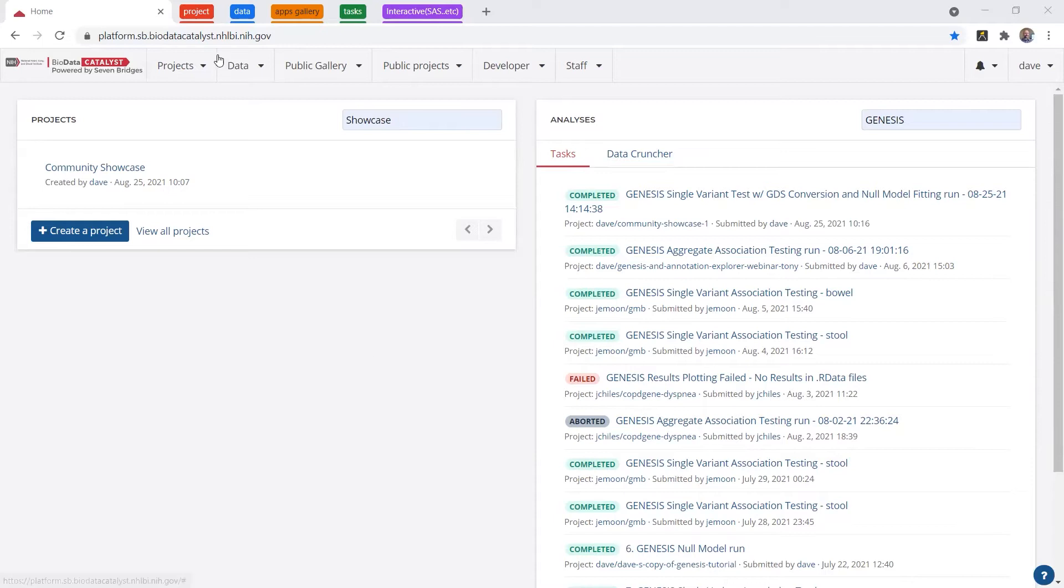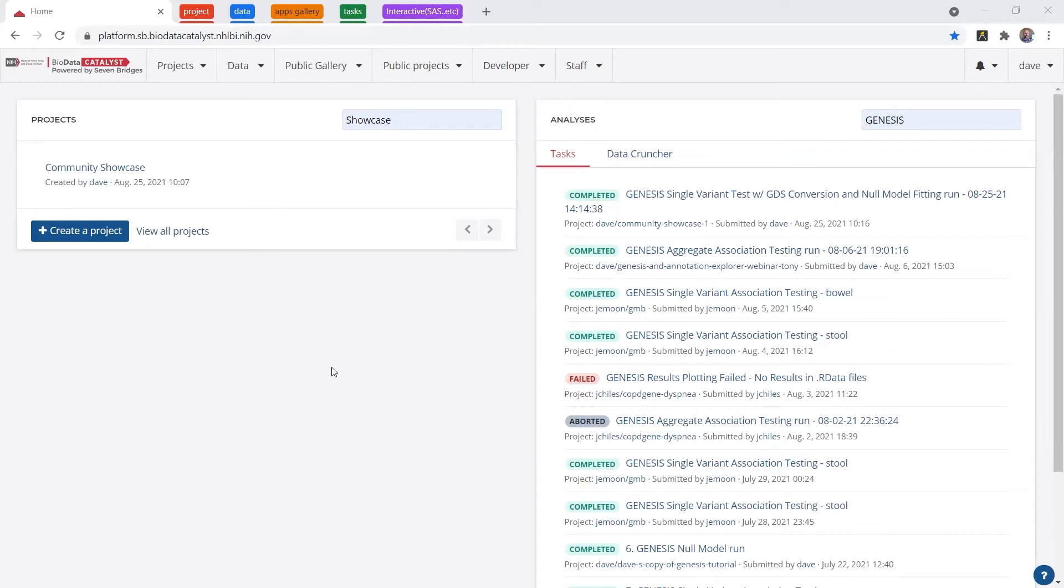So when you log on to this URL, and by the way, I'm just in a Chrome web browser, if you're wondering, the only requirement is a modern web browser to access the platform.